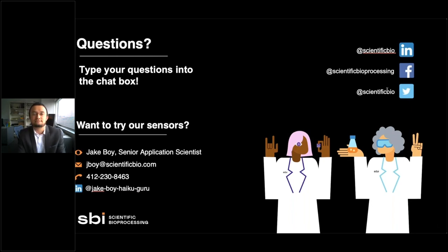Yes, I have. The reason why we designed this device using PDMS is just because it's so convenient in terms of prototyping, right? You can easily print a 3D mold if you have access to a soft lithography facility. You can also very easily prototype devices. They are cheap when you make them with PDMS, and you can just throw them away when you're done with your experiment.